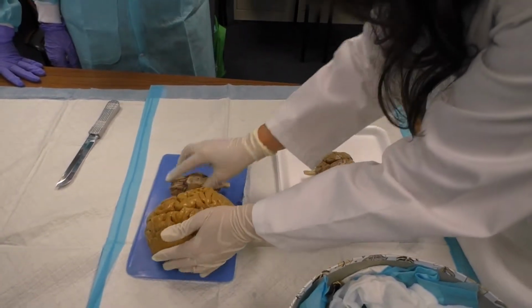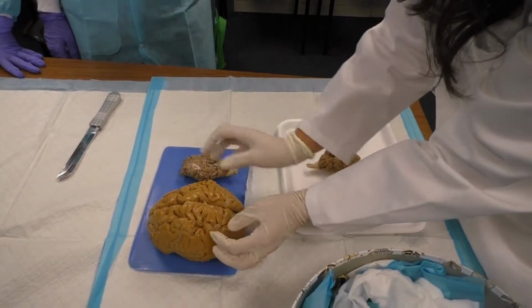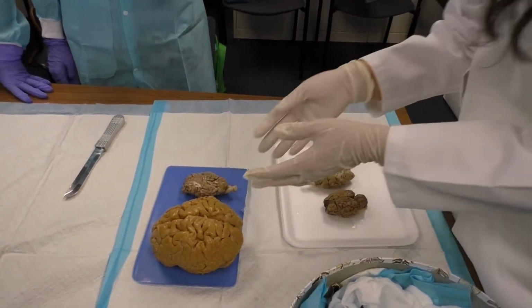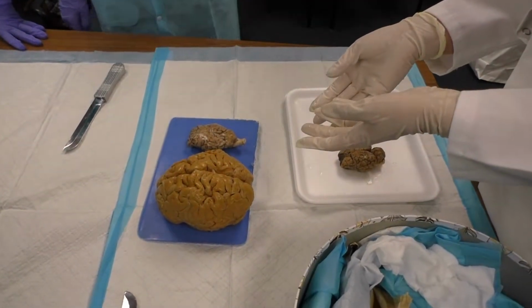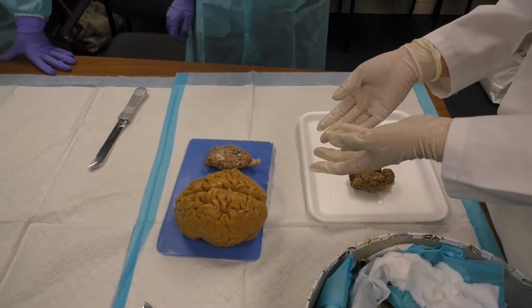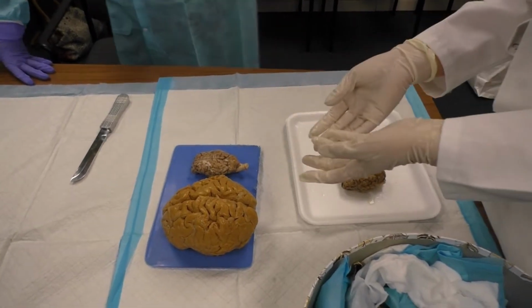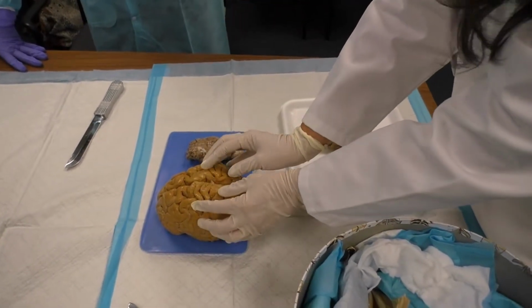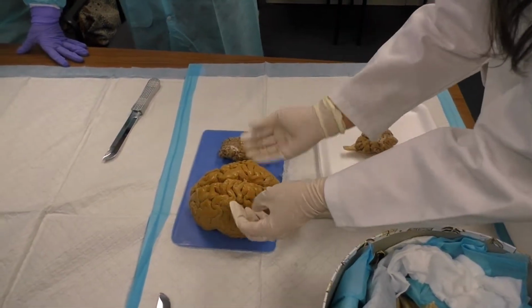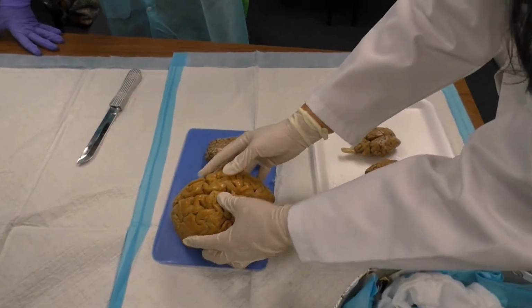So let's go back to the ridges. All of this infolding, what is that good for? All the infolding that you see on this outer covering or cortex. Why is that important? You were talking about surface area. And what about surface area? What is good or useful about that? It increases it so you can jam more in a little space. Right. So it increases basically the computing power of all of these cells that are making up this infolded structure, helping the computing power of the brain. We have a lot of computing power.